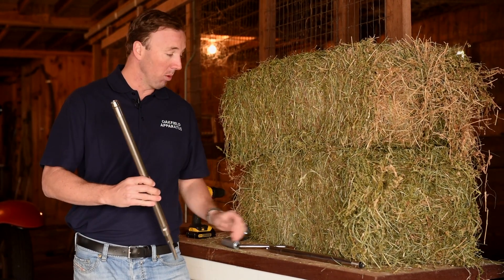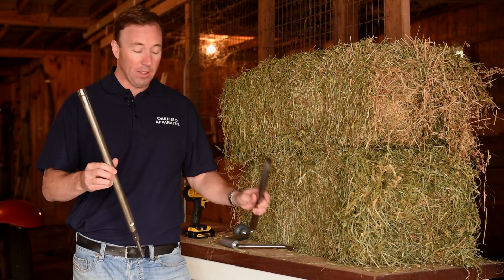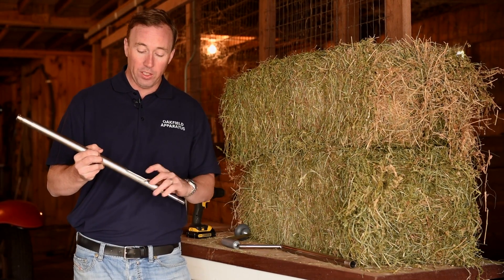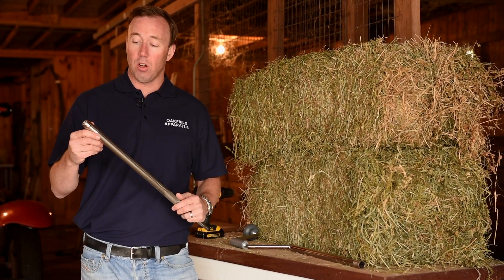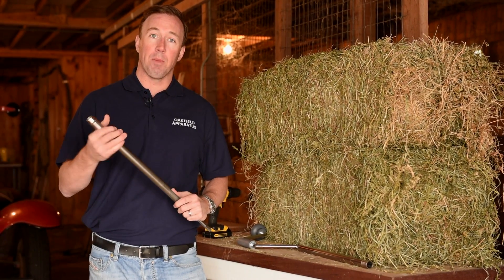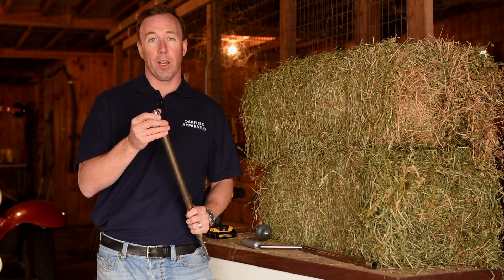We have two different types of probes: a closed probe in case you're worried about cross-contamination, and one with an opening in the front that allows for easy hay removal, visual inspection, and cleaning. They're both 18 inches long, take a three-quarter inch sample, and are made of high-quality stainless steel. They also use a removable serrated tip to easily cut through the hay.